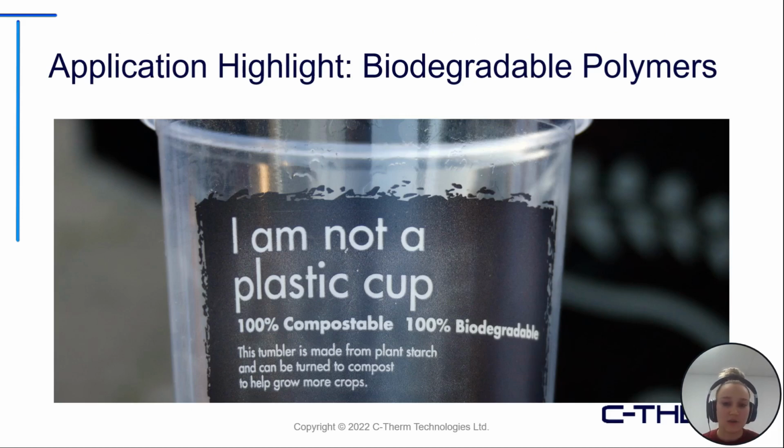The next application we have is a biodegradable polymer sample. Now, this is also a really great one I like to show when justifying why you would need sample observation. With the world turning away from plastics and looking for alternatives, there are a lot of new biopolymers being developed. And we might not necessarily know when things are going to happen, at what temperature points, when it's going to melt, when it's going to decompose, that kind of stuff.